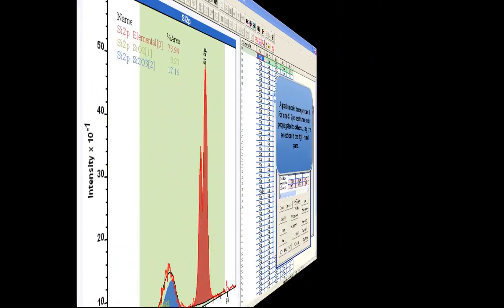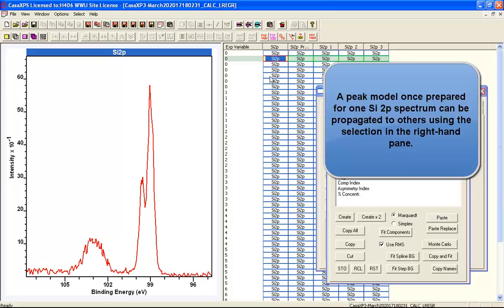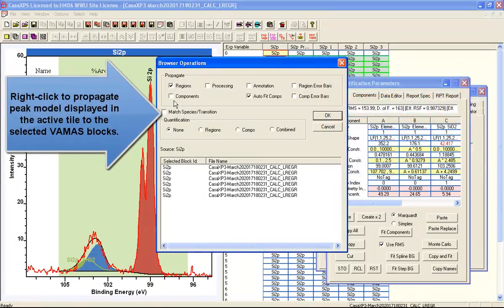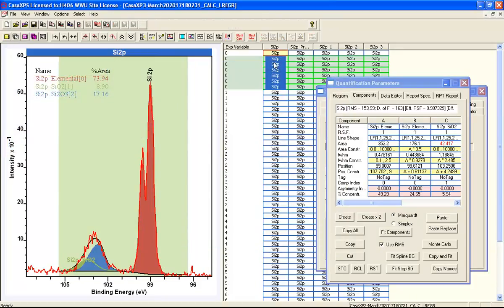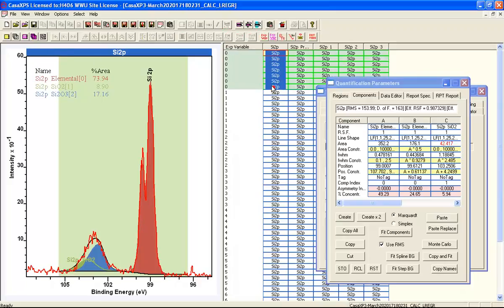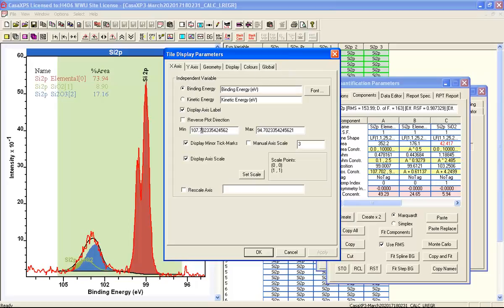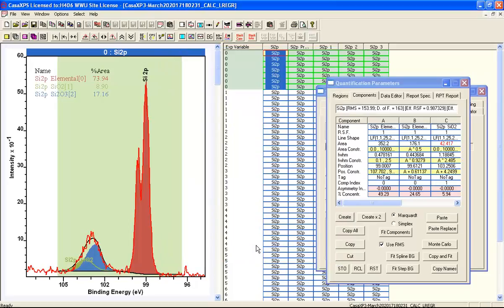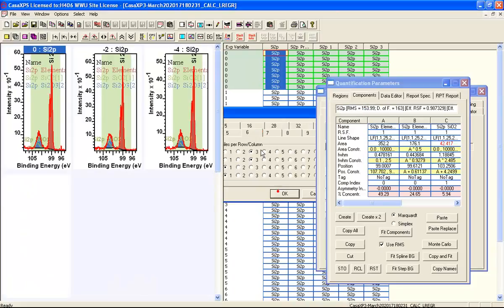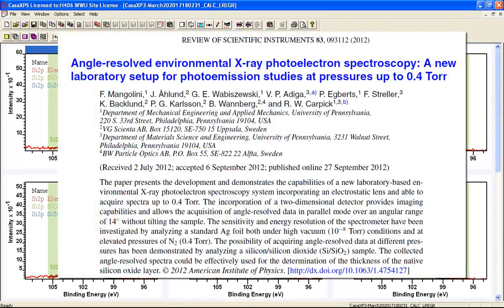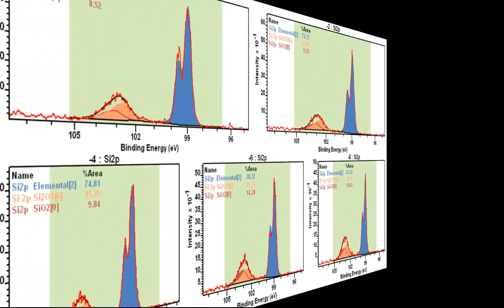We can display the spectra using the component indices to get a common color scheme. Once we've got a peak model, and we have other spectra to which this peak model must apply, we can propagate the peak model and the annotation. We then end up with a set of spectra all of which have been fitted. The propagation applies to the selected spectra — the experimental variable ranging from zero to minus eight representing angular changes in the measurement — and so we've ended up with a decomposition of these silicon 2P spectra into a peak model that we can feel confident with.